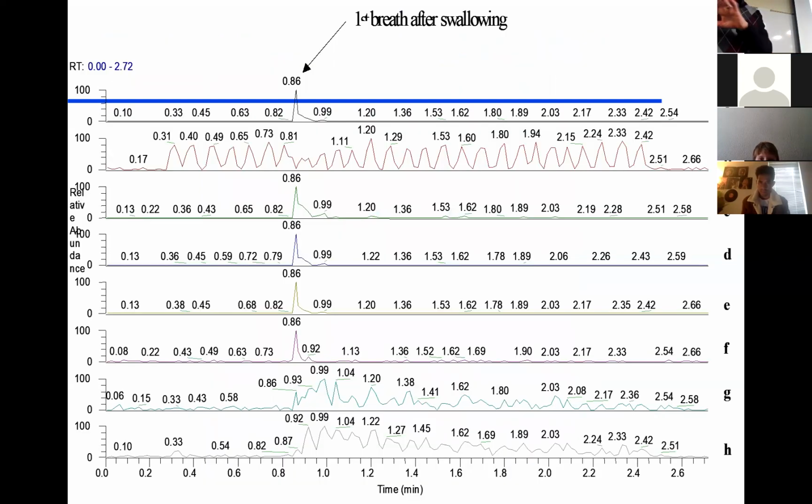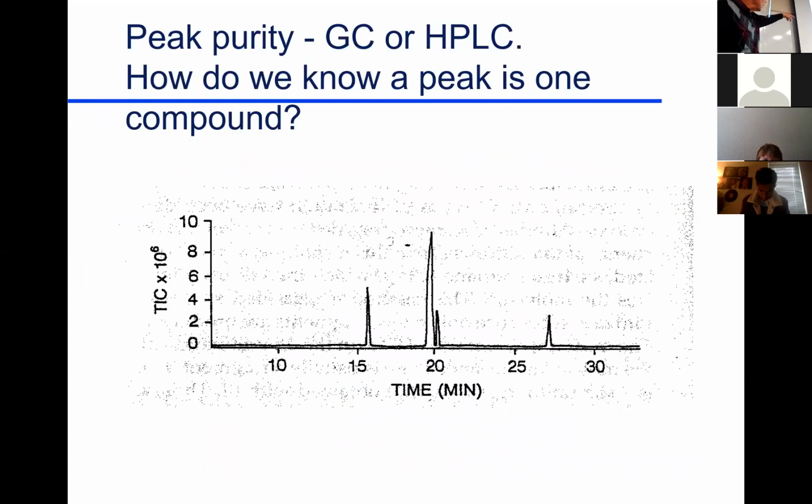Now this one I hope you don't get lost with, but I'll try to make it a little bit easier, a little bit briefer. So this is the spectra of his breathing. All living bodies give up acetone. It's part of our body's metabolism. So every time we exhale some acetone. It's part of our metabolism, okay. And so these bumps up here, the red ones up here, they basically are measuring his breathing. That line goes up when he exhales, it goes down when he inhales, and so on. And then all the rest of these other lines that come across.